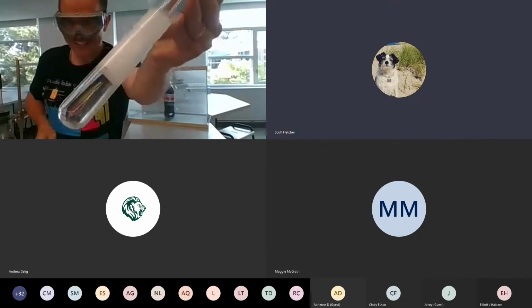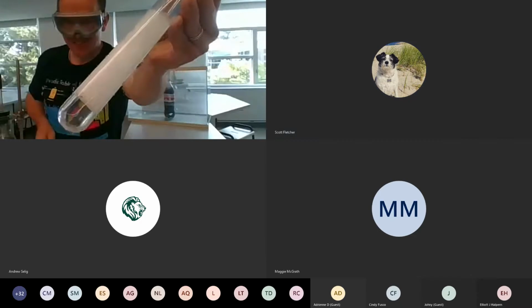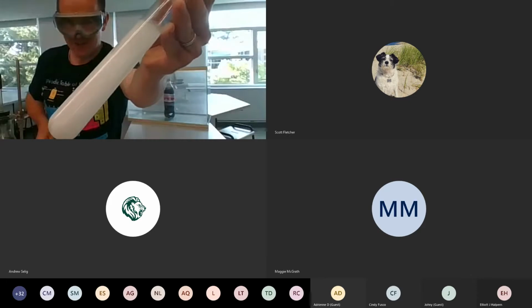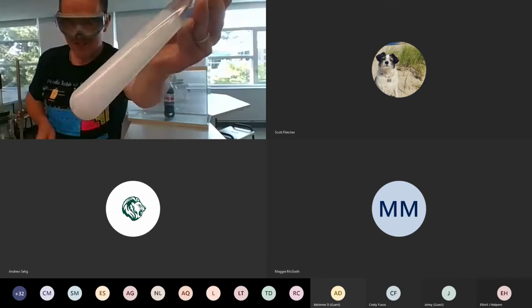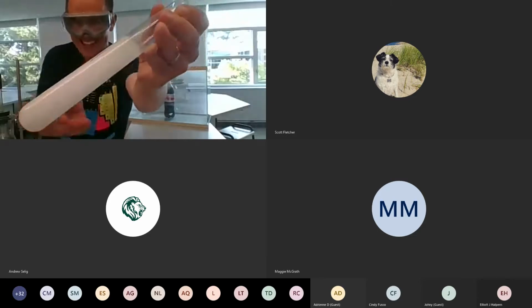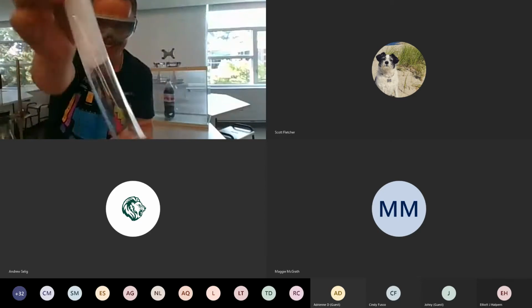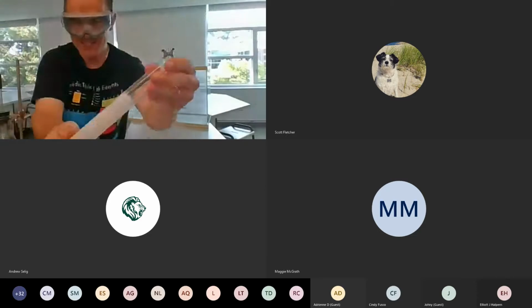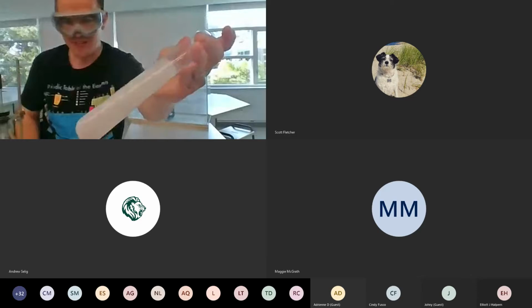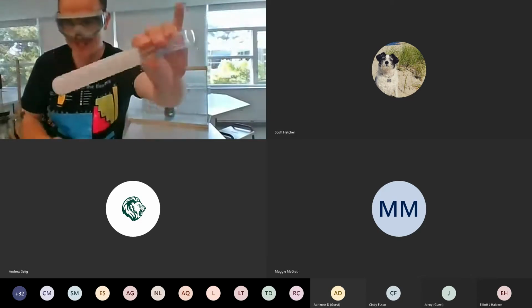That is cool. So now we'd say it's crystallizing out. Because remember, supersaturated is too full. So when we give it a little place to crystallize out, it realizes, oh, wait a minute. And then we turn it upside down and it doesn't come out. Unfortunately, I can't pass this around for you to feel the test tube, but it's quite hot. So that's an exothermic process right there. Kind of looks like it's frozen, but it's actually quite hot.